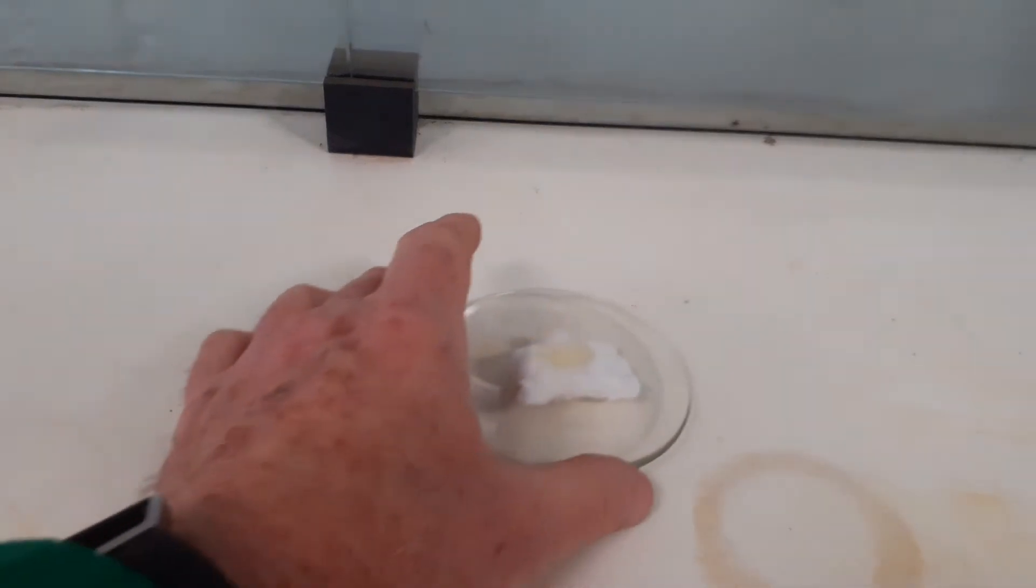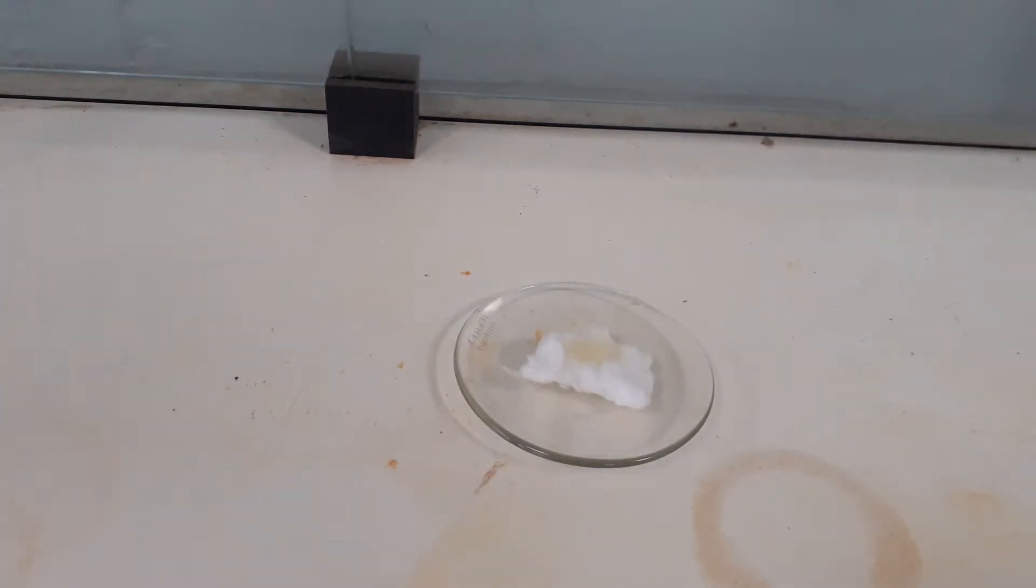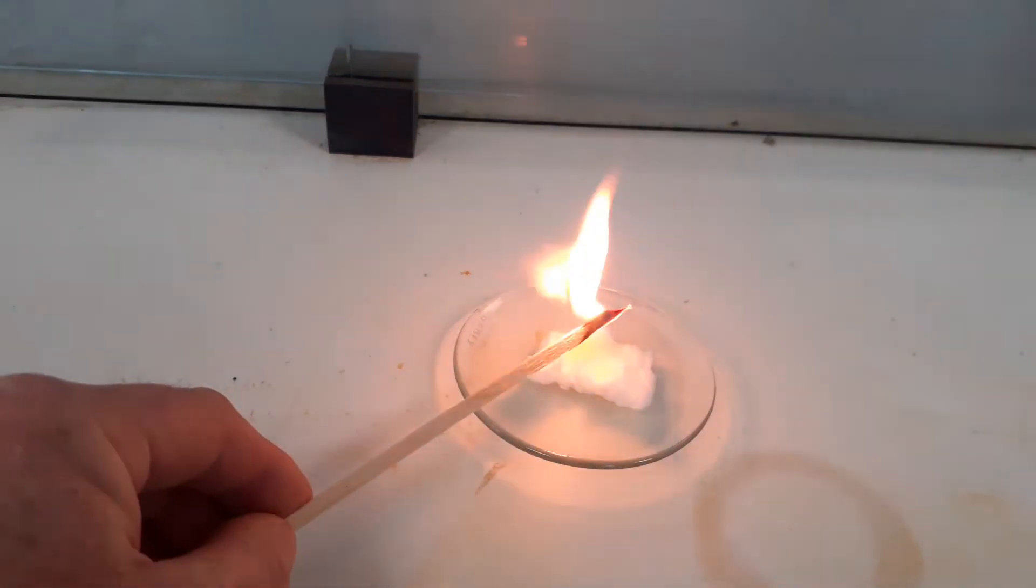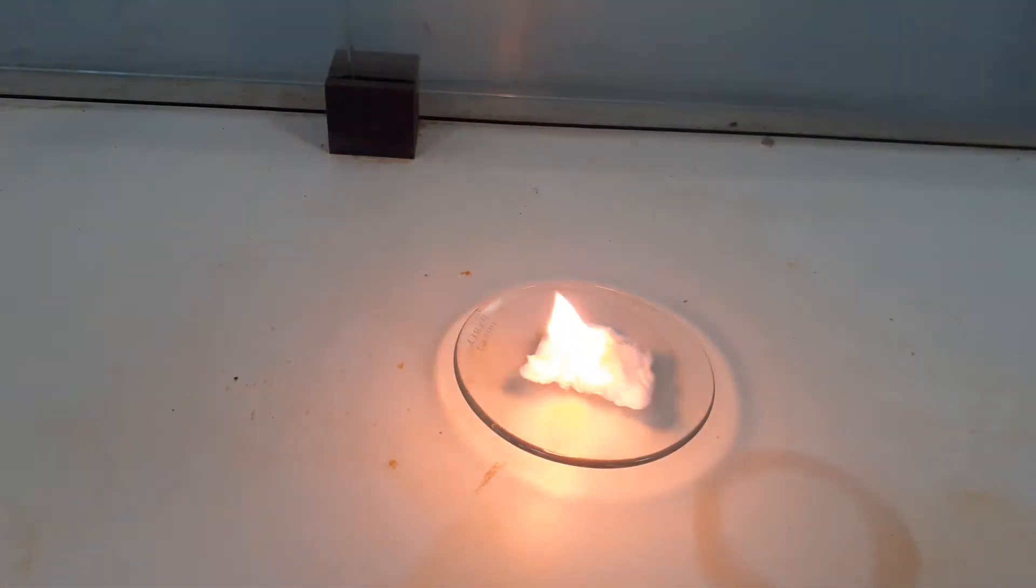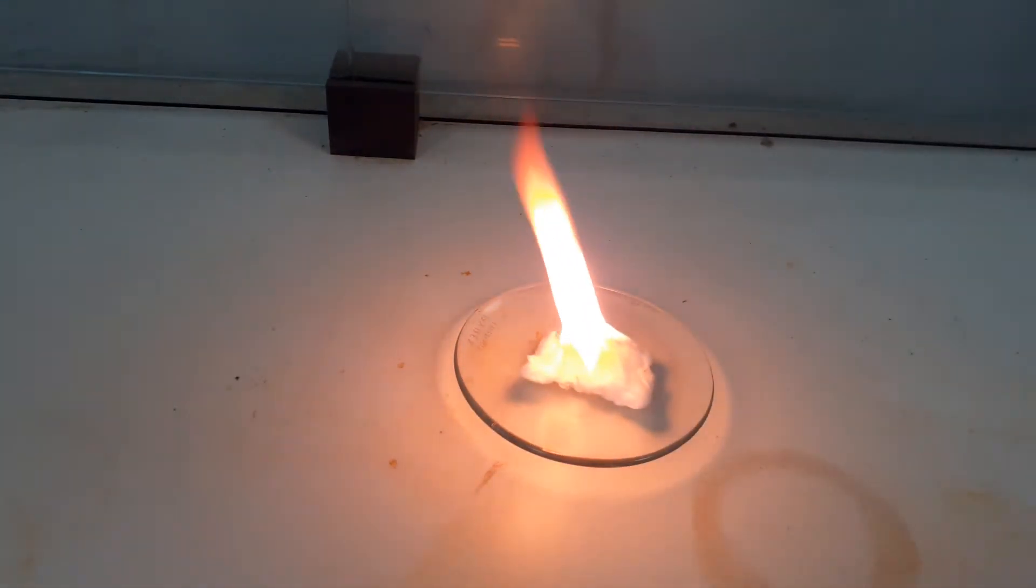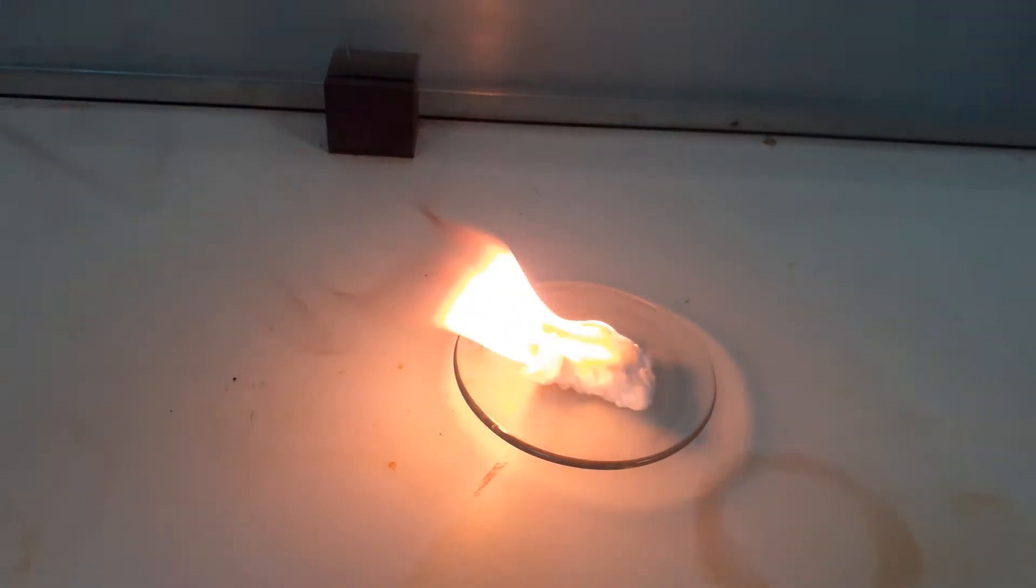Now there's a small amount of petrol on the mineral wool. I'm going to ignite that now and let's look at the flame and how it burns. As we can see it's a relatively non-smoky flame and it's quite yellow. So that's petrol as it burns.